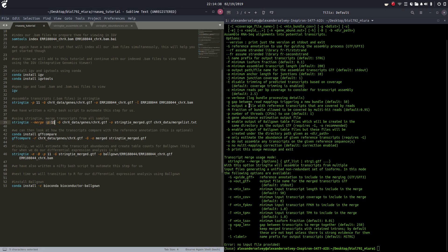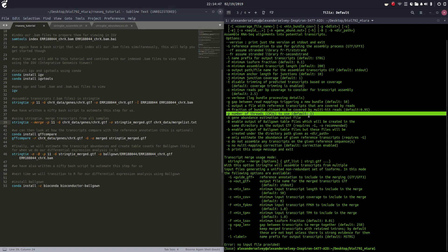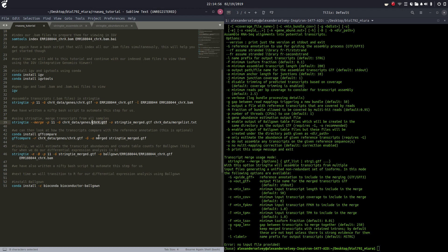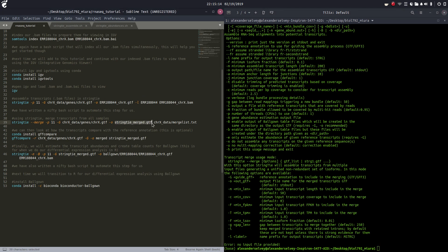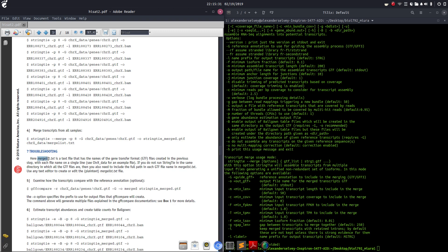Dash-p is for the number of threads to use. Dash-G is our guide GFF, our reference annotation, which will be our chrX.gtf. Dash-o is our output file. We want to create a new file called stringtie_merge.gtf. Our chrX_data/merge_list is going to be a text file - merge_list.txt is a text file that has the names of the gene transfer format files created in the previous step, with each file name on a single line.